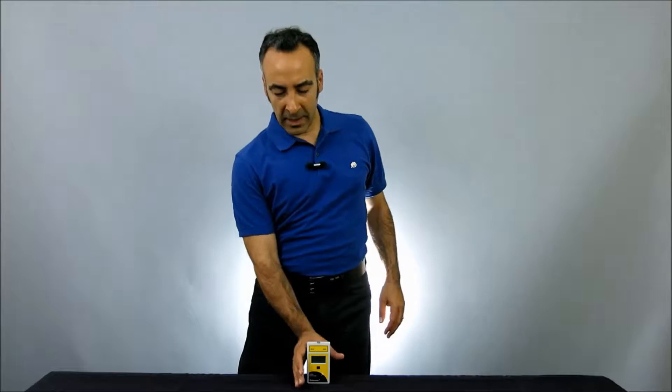Hello, I'm Moshe Levy, Vice President of Marketing at Solar Light. Today we're going to be taking a look at our Solar Meter Model 6.4 Vitamin D UV Radiometer with Integral Sensor. The 6.4 is the leading choice for extremely accurate instantaneous Vitamin D3 measurements from both UV lamps and from sunlight.